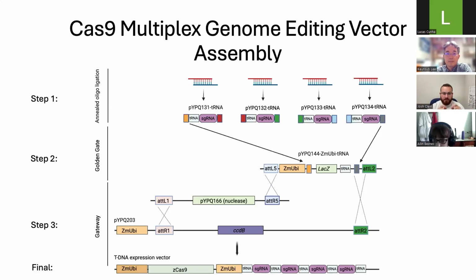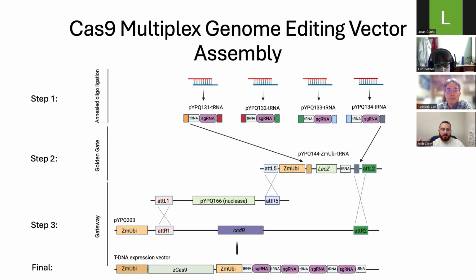Now, we specifically use that system for Cas12a because the stem loop, or you might think of it as a tracer RNA scaffold or feature of the Cas12a, is at the 5' end of the guide. And that hammerhead actually requires a 6 nucleotide complement at the 5' end. So if you're using that for Cas9, your guide RNA begins with your unique sequence, and then you would have to change the sequence of your hammerhead to complement with that for every different guide RNA that you use.